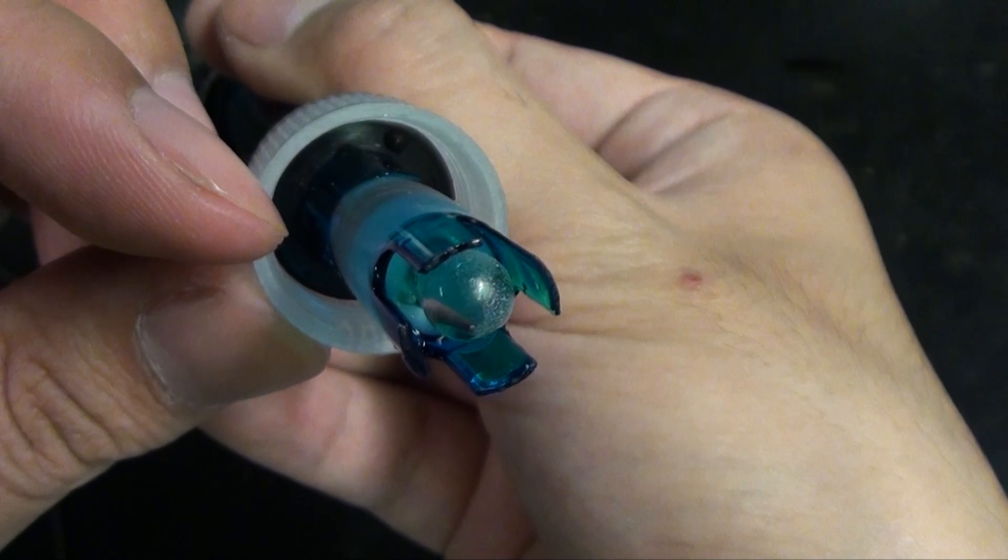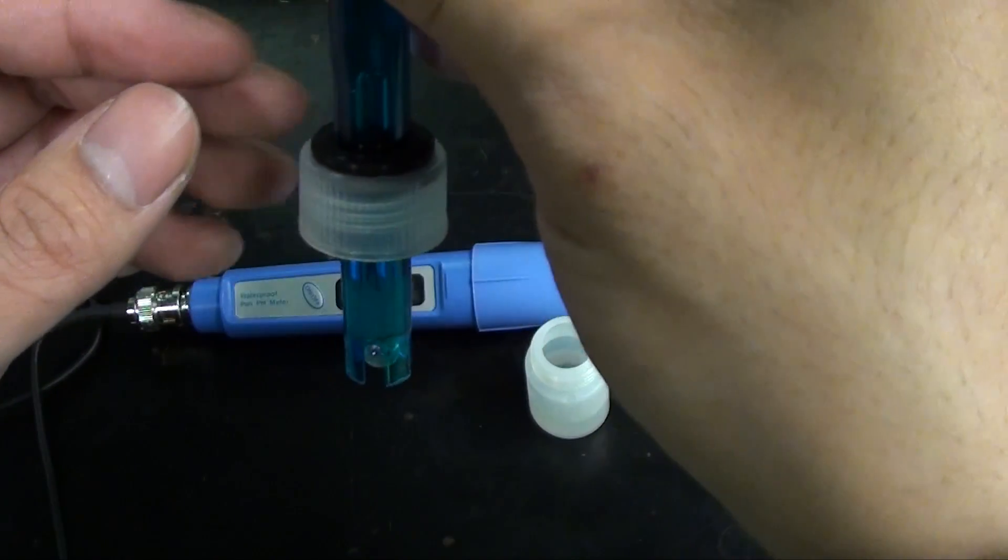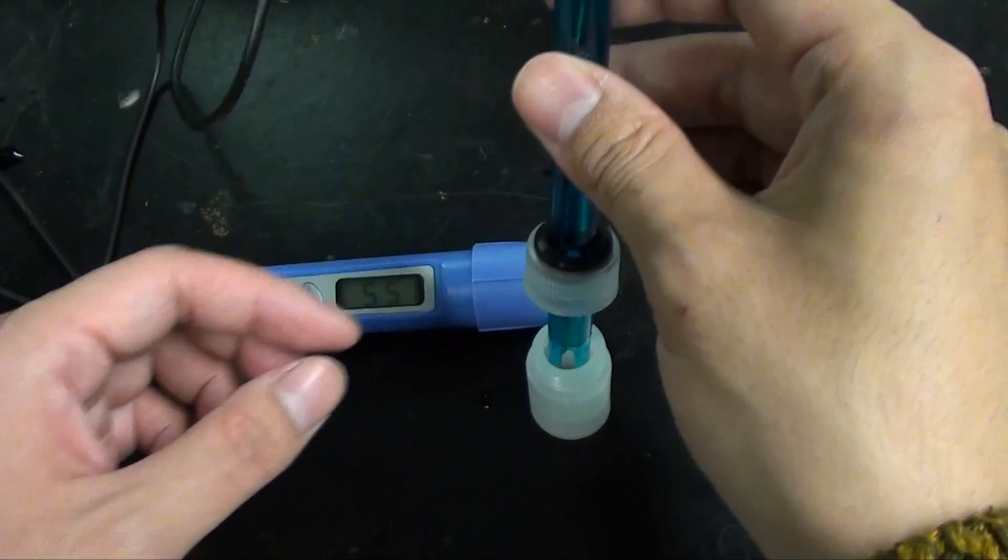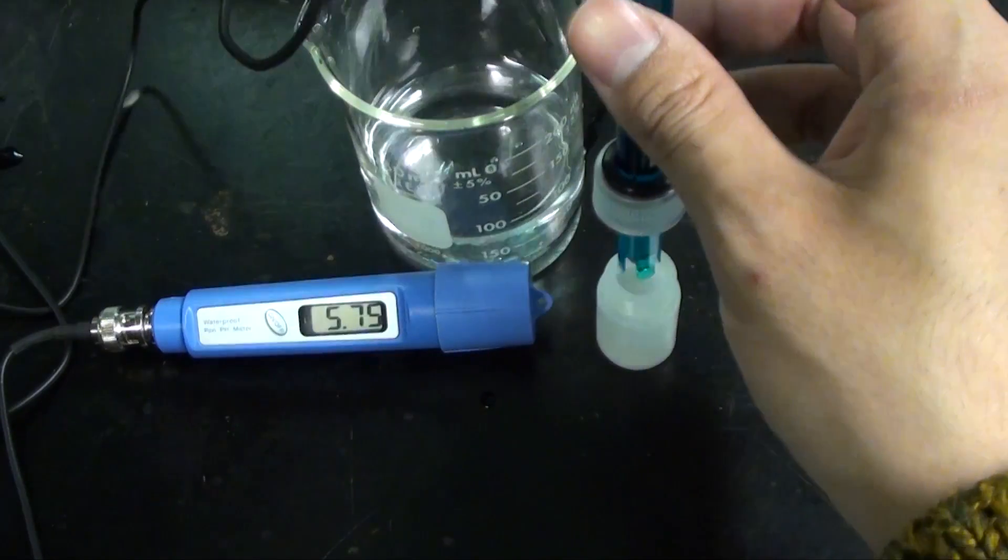For the glass electrode to work, you must immerse the electrode all the way up to this reference electrode. Otherwise you'll get erratic and irreproducible readings. Now I'm going to dip the electrode into some distilled water to wash off the storage solution.